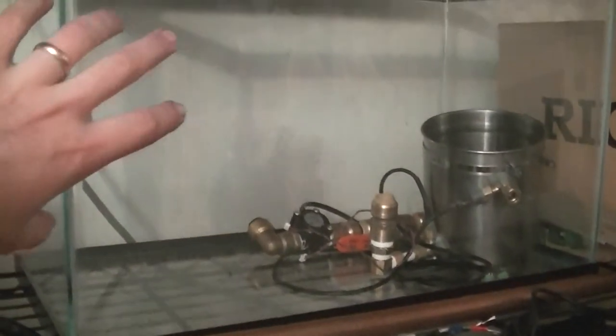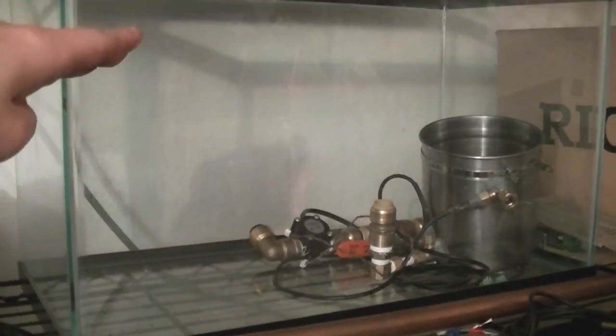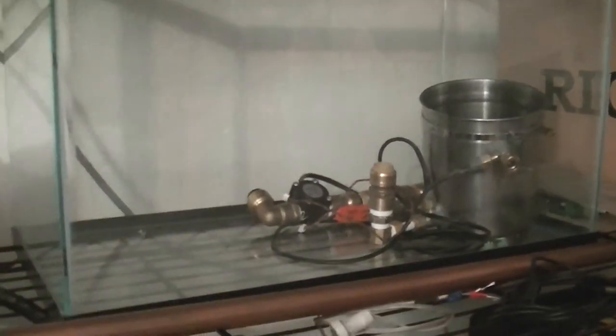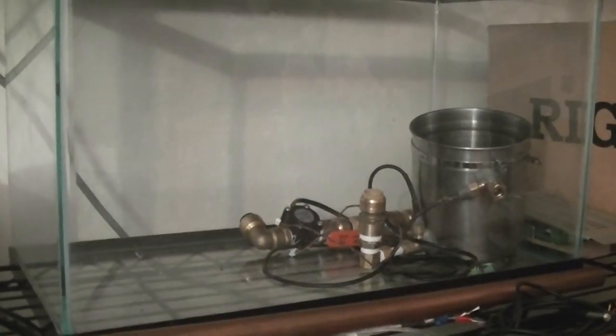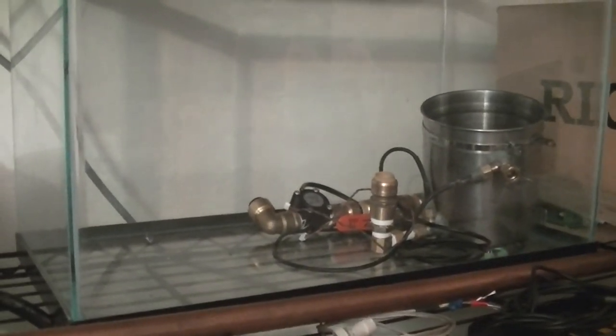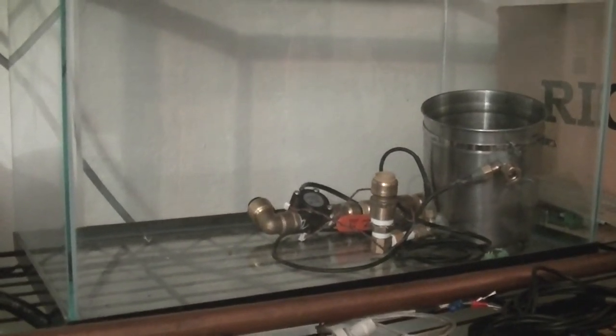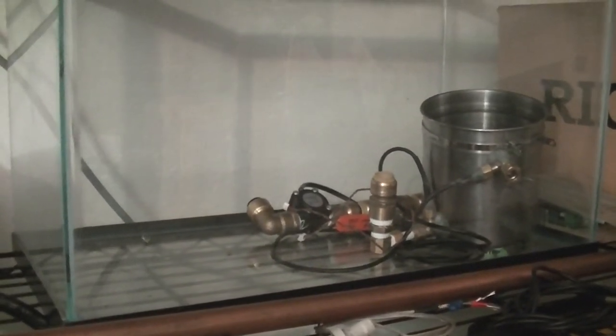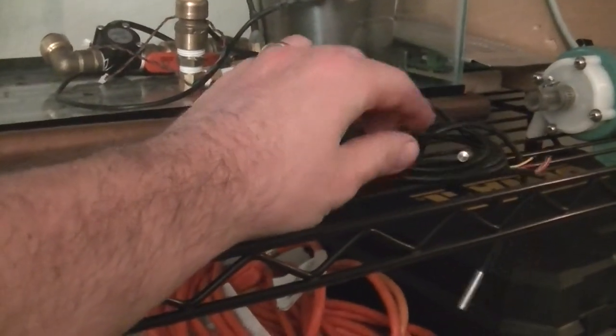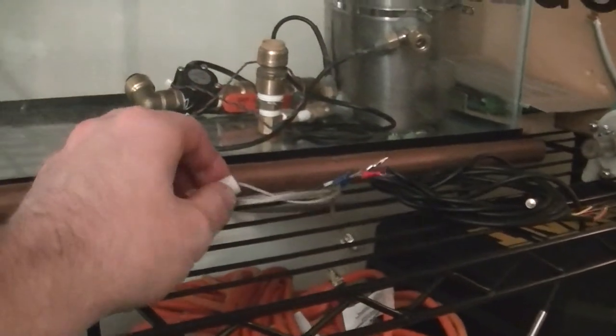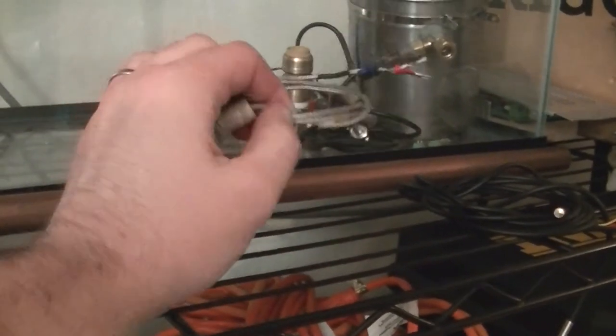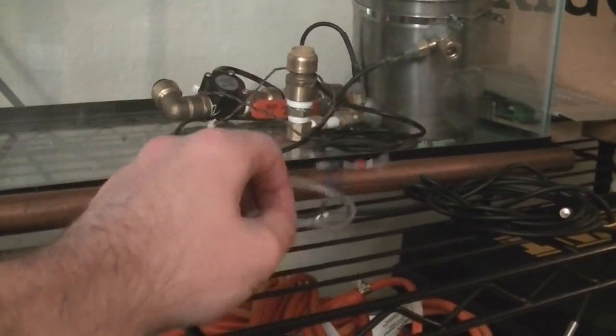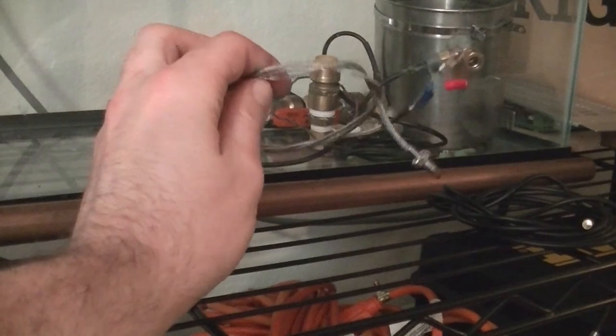It's a combination of bomb calorimetry or coffee cup calorimetry and flow calorimetry. And so the outer reservoir is also the outer water jacket. And that way I can take a before and after measurement of the water itself to get good readings. And I'll have to do a bunch of calibration runs to really pin it down. But I think it'd be easier that way and more accurate. And I'm using these little thermistors. Very good resolution considering. And then K-type thermocouple for a reaction site.